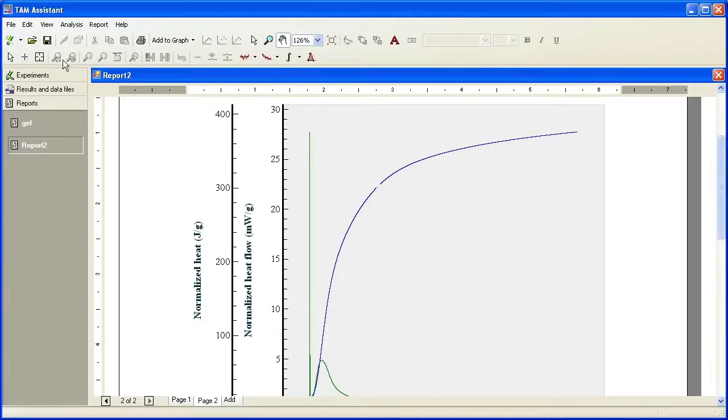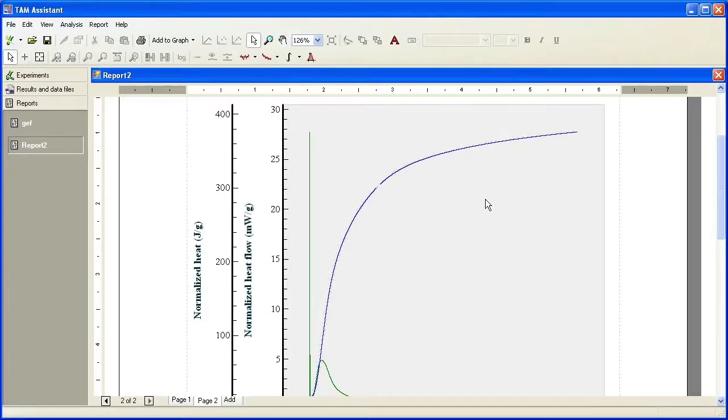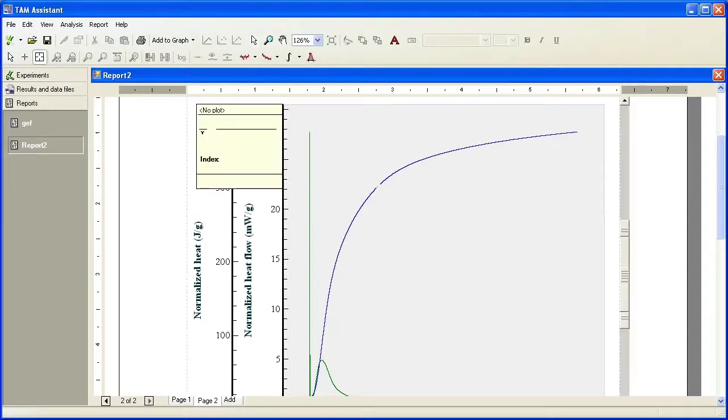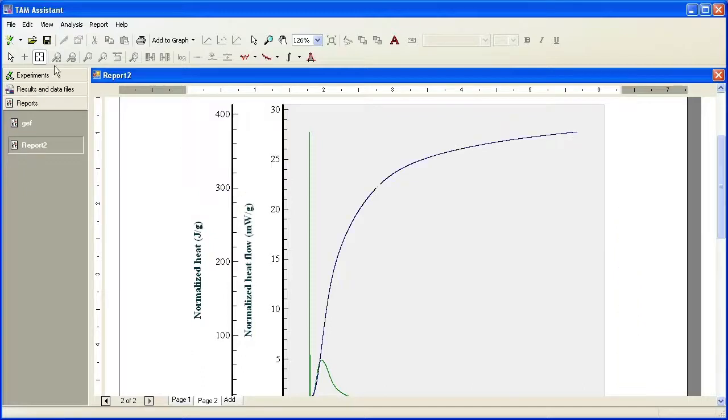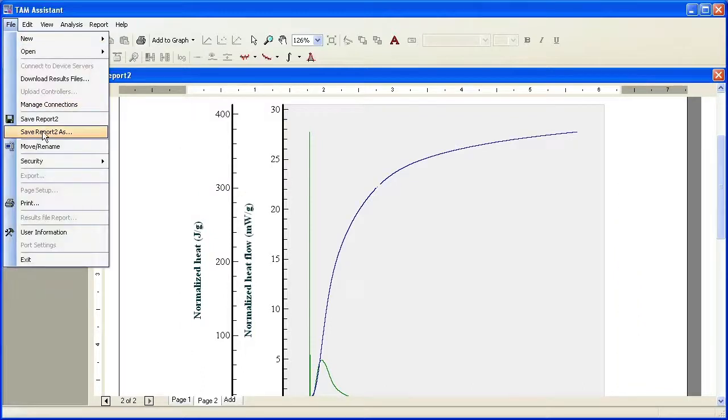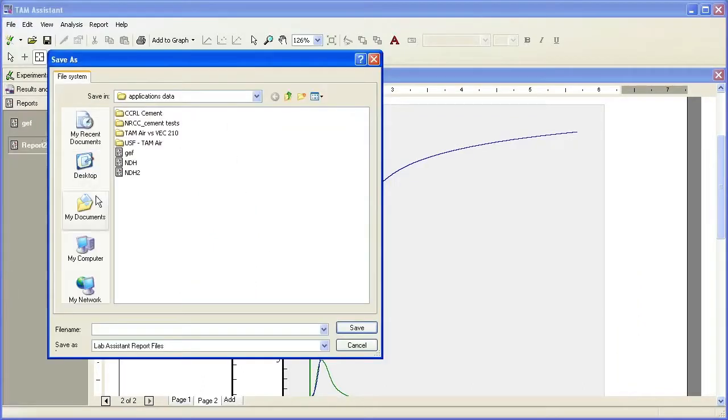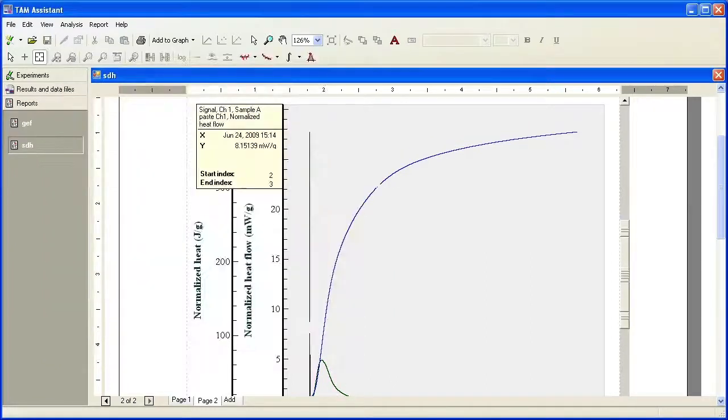Again, I can use my zoom or enter selection mode to change the properties of the plot. I could use the data reader to read the seven-day hydration of my cement here, and I could also save this report at a later time to open up in TAM Assistant.